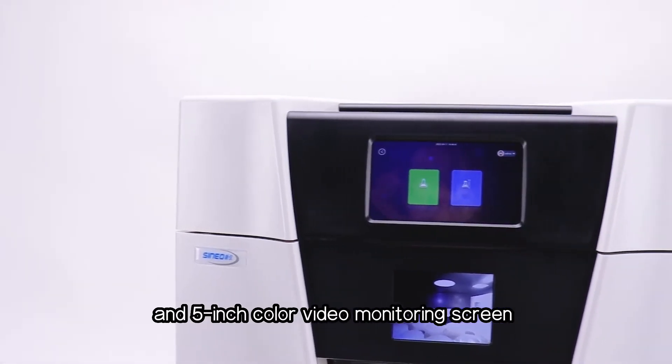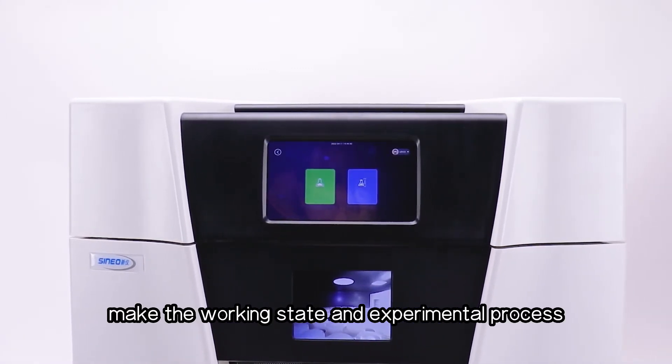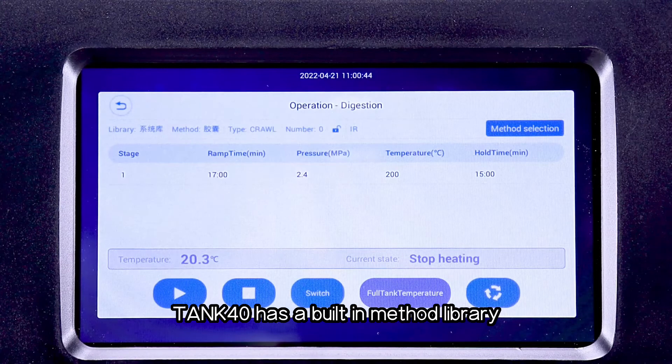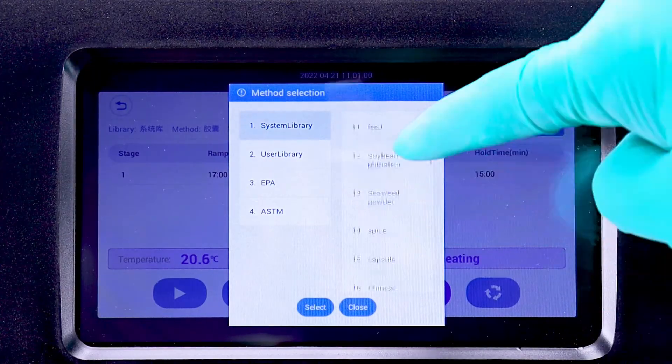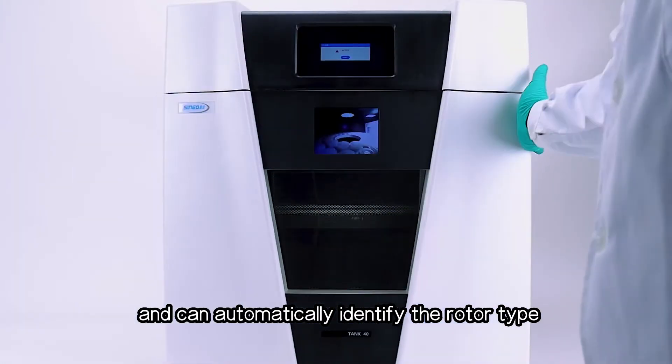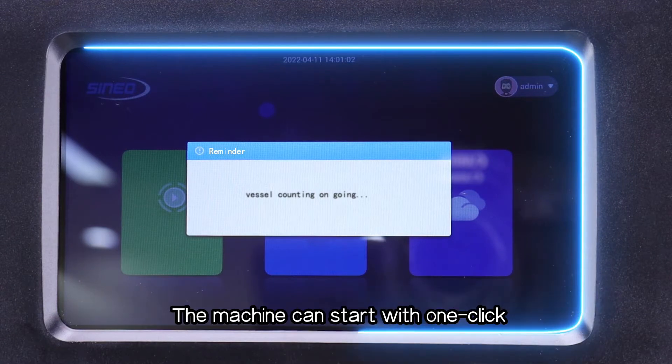A 7-inch color touchscreen and 5-inch color video monitoring screen make the working state and experimental process clear at a glance. Tank 40 has a built-in method library and can automatically identify the rotor type and count the vessel number to set up the digestion program automatically.